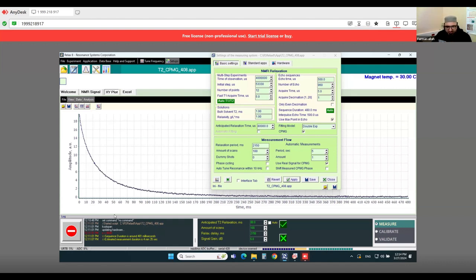We are still waiting for our result. So finally, I think I will proceed with these three results, because if we go to other examples, we have a time limitation. So it will be good that I reduce to these three examples: white, yellow cheese, and the 70% chocolate hummus. Yeah.